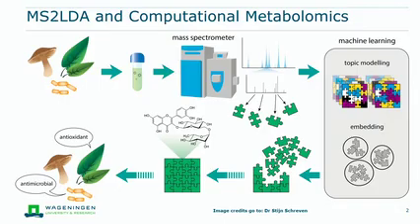They gave me like 2 minutes, which I think are over now. So it's my pleasure to give the floor to Esteban, who will now show you a demo case of MS2LDA.